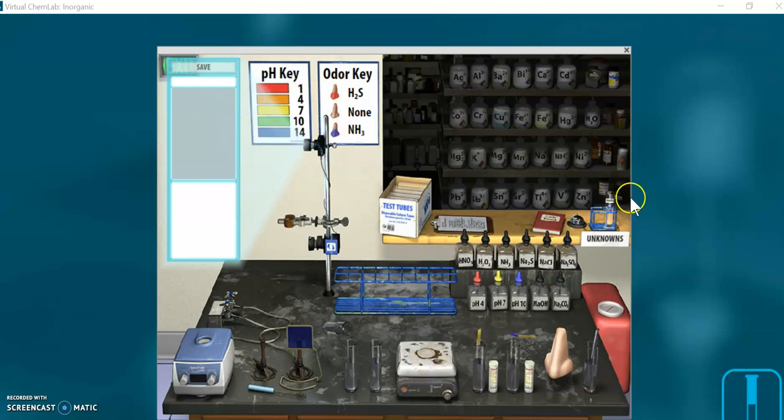And it says to click create unknown. So after I clicked up here, you might not have seen it, but over here we have an unknown. It says practice unknown. You can see that over here. I'm just going to drag this guy over here to our test tube rack.